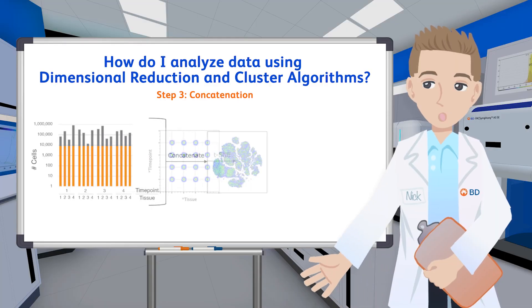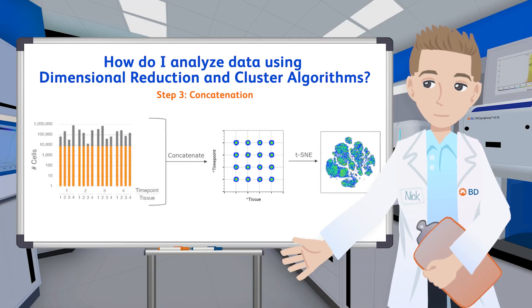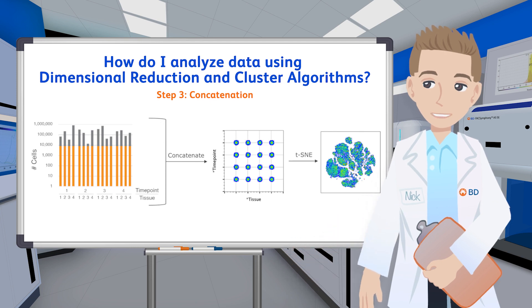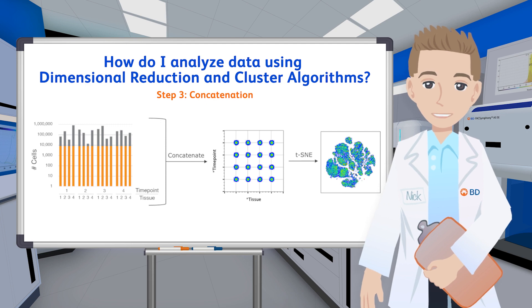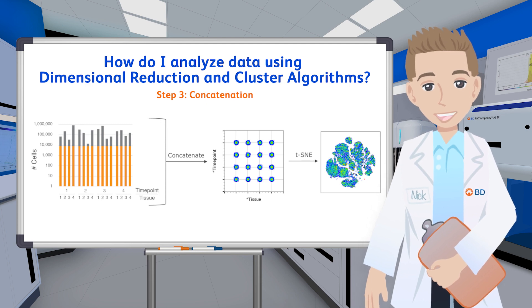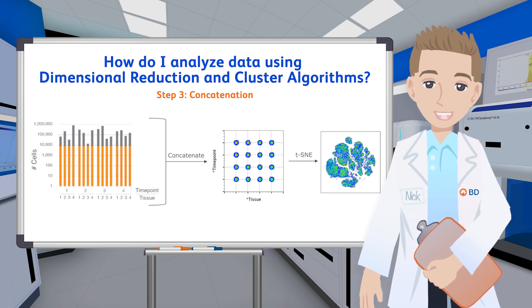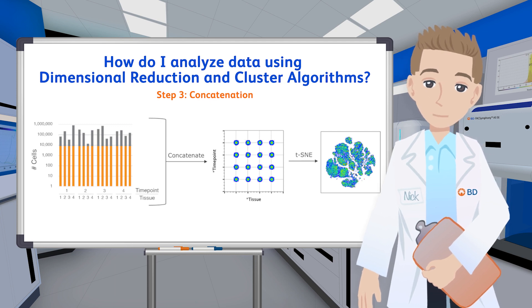The primary difference between standard immunophenotyping and our high-dimensional workflow is the concatenation step. We have to merge all of our samples into one file before we can run the high-dimensional tools, due to the nature of how those algorithms work.